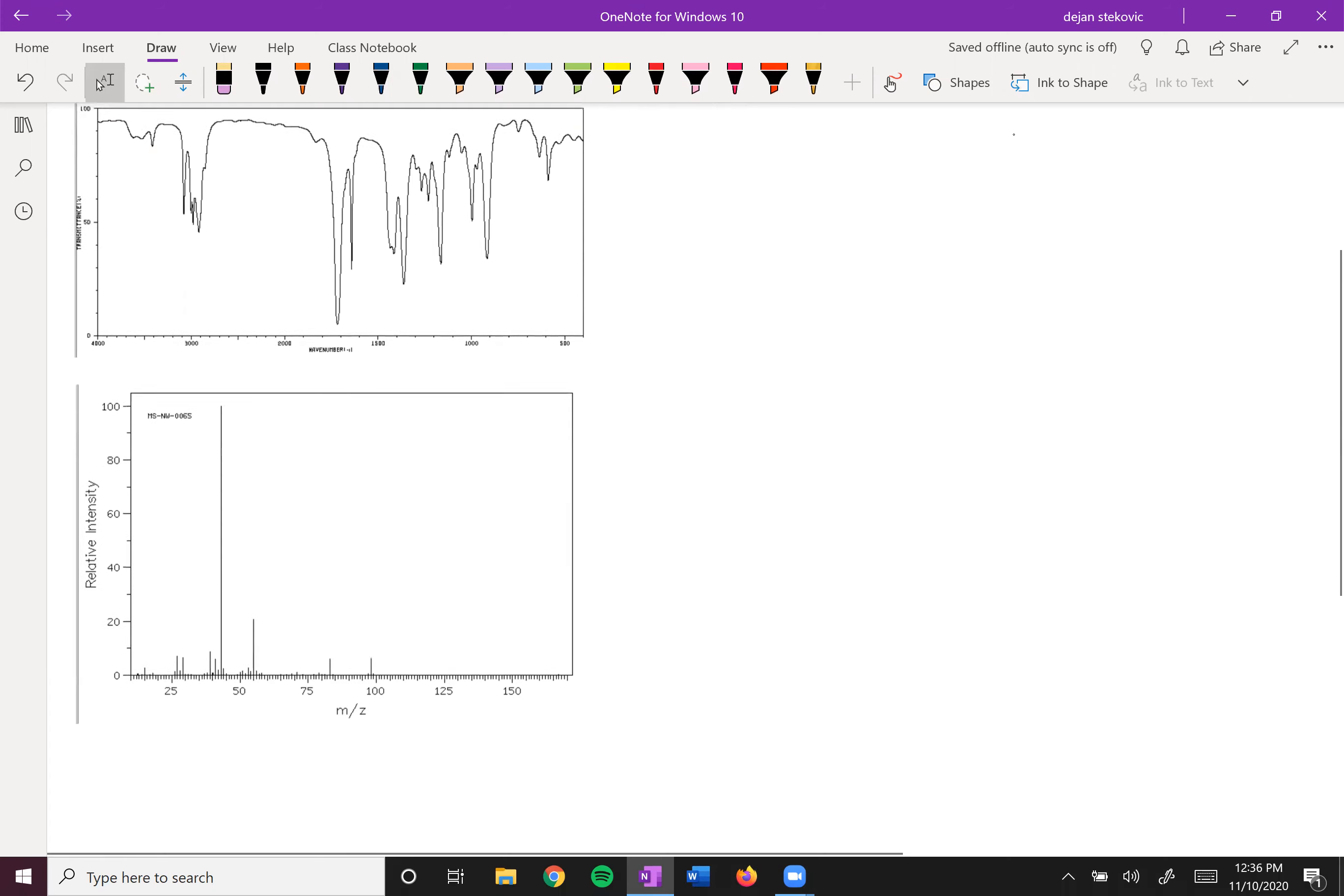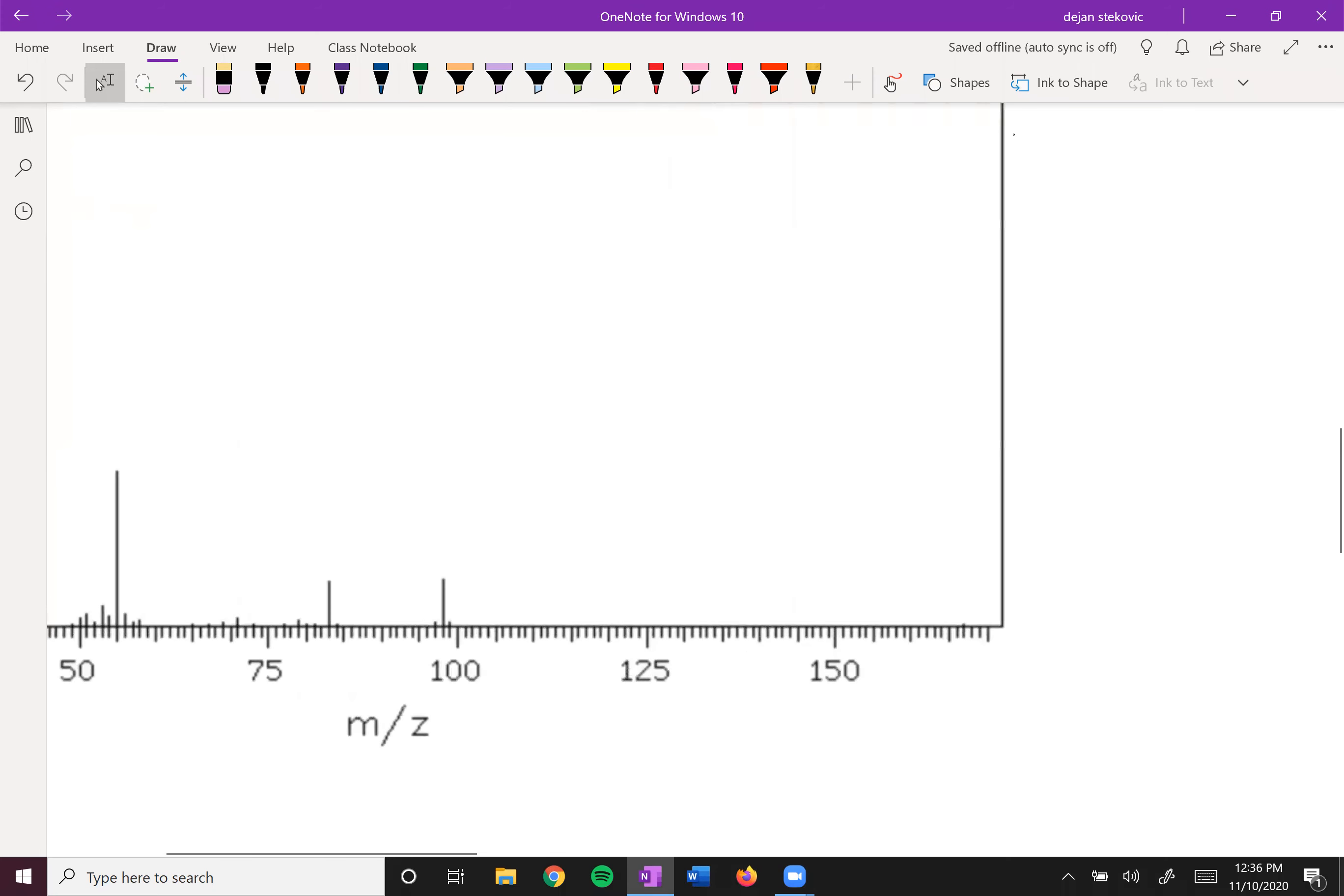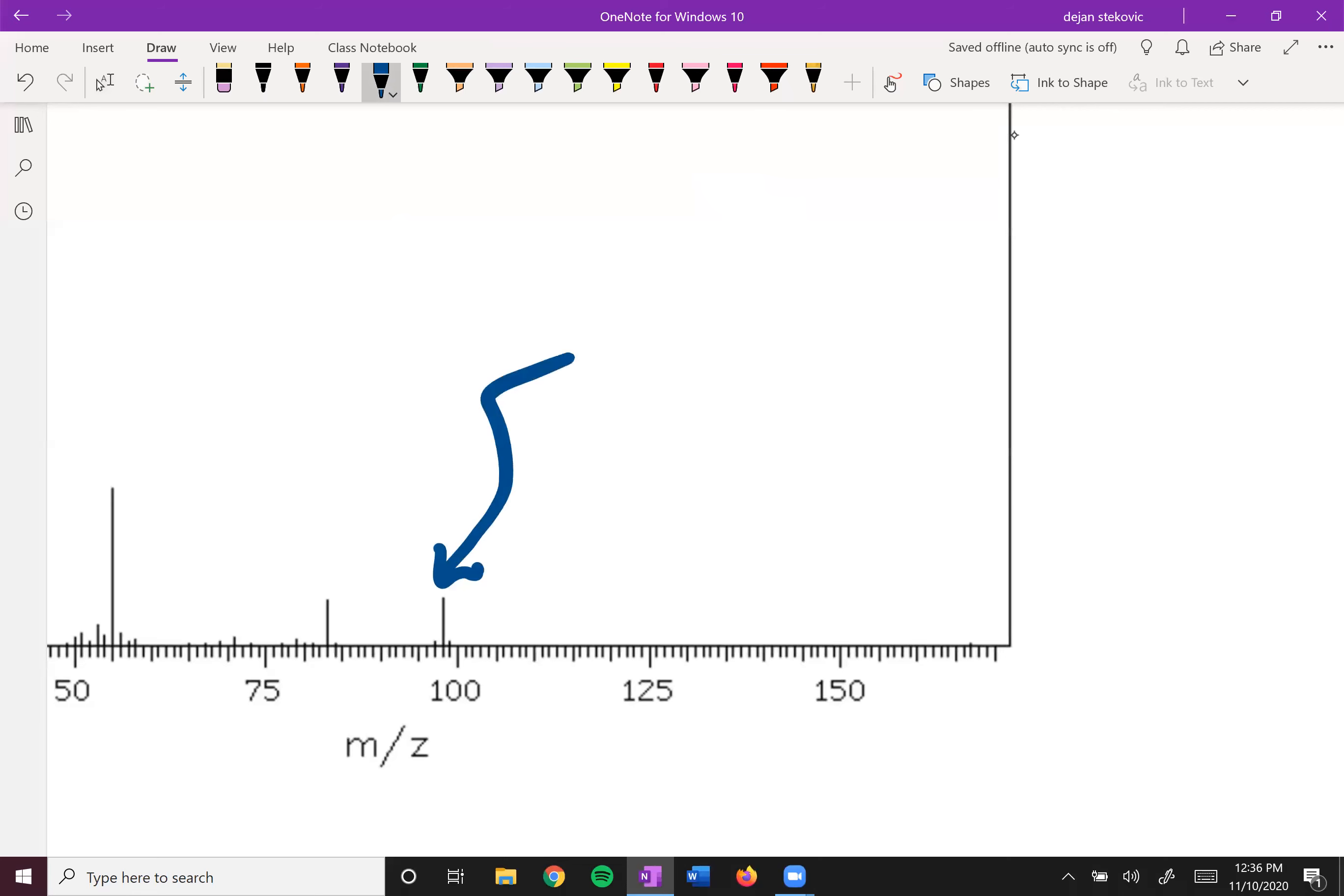I would start at the mass spec and identify your molecular ion peak. In this case it's right here - you can see that this is at 98 grams per mole.